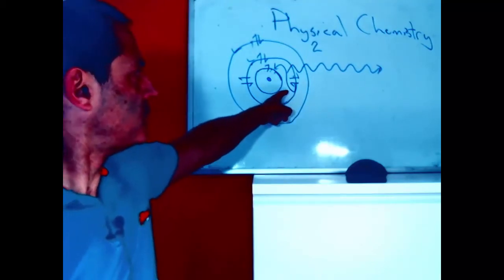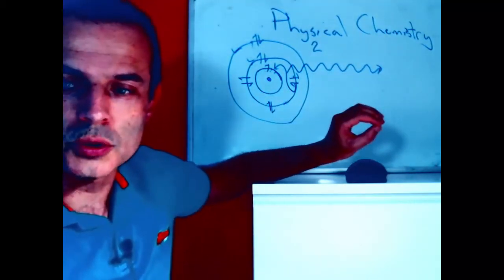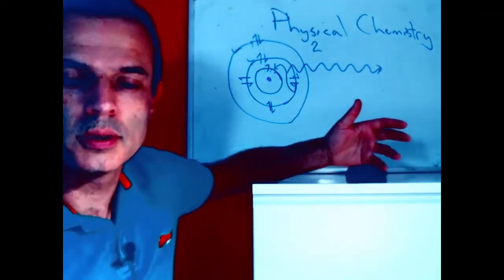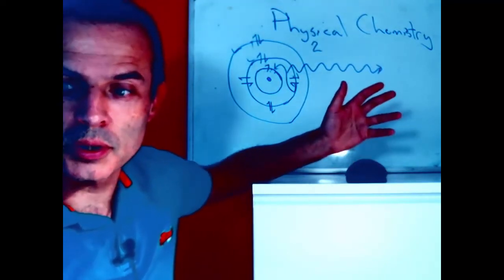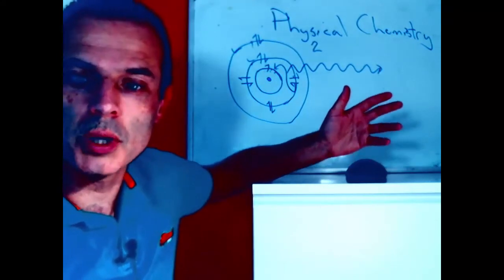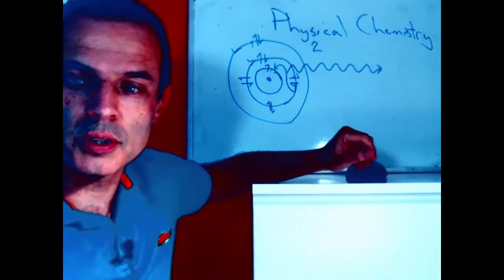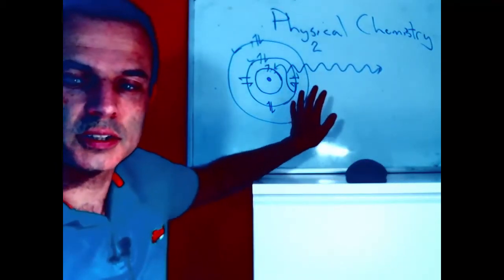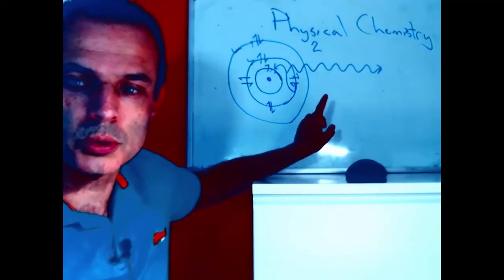The advantage and disadvantage is because it's an internal level, we don't see that because they tend to shift together, so it's a lot smaller. It becomes more difficult to measure. But if we find something lying around, or we get given a sample by a company to measure, or we're doing forensic analysis and it's something that was found at a crime scene, we don't know what it is to start with, this is an excellent technique to start with because it tells us what elements are in our sample.